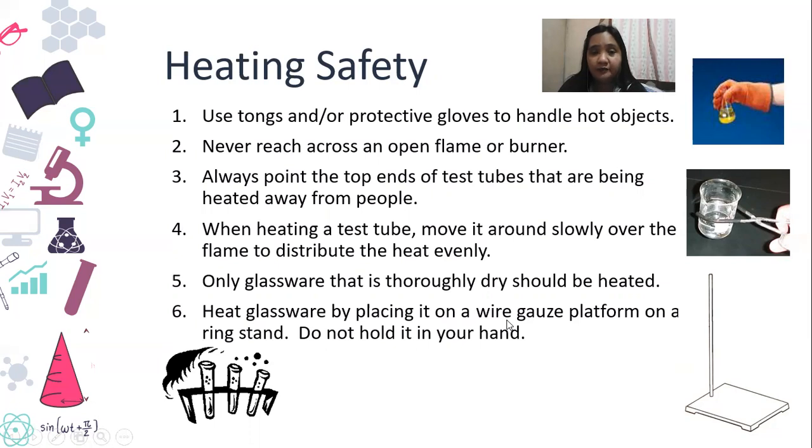Heat glassware by placing it on a wire gauze platform on a ring stand. Do not hold it in your hand. So this is a stand wherein we can put your wire gauze, or whatever. So make sure it's just very simple. Never touch really heated objects right away. If you're trying to tidy up, make sure you have them cool down.